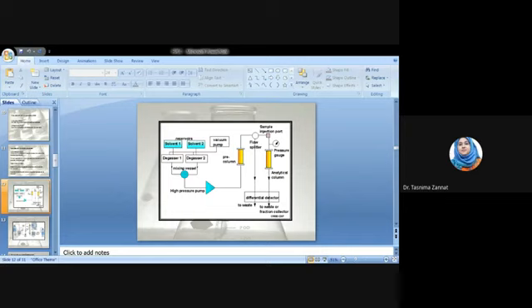Now the very important part, the pumps. What is the role of the pumps here? The role of the pump is to force the liquid, which is called here the mobile phase, through the liquid chromatograph at a specific flow rate. It means in a uniform rate, expressed in milliliter per minute. The normal flow rate is in the range of 1 to 2 milliliter per minute.